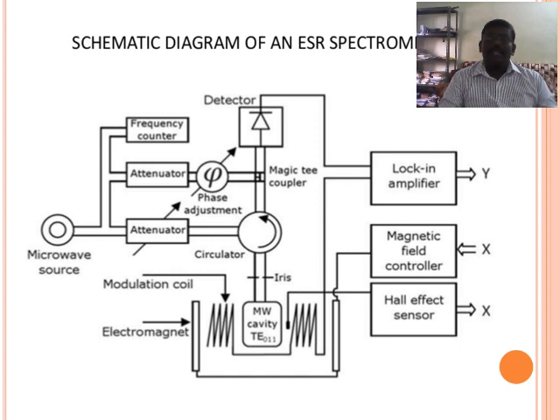The waveguide is used to convey the microwave power to the sample cavity. What is the sample cavity? It is constructed and placed between the maximum magnetic field. Most ESR instruments have a dual sample cavity: one for the sample, another for the standard material. The electromagnet: the ESR spectrum is recorded by slowly varying the magnetic field through the resonance condition by the current supplied by a power supply. Both the power supply and the magnet need a water cooling system.